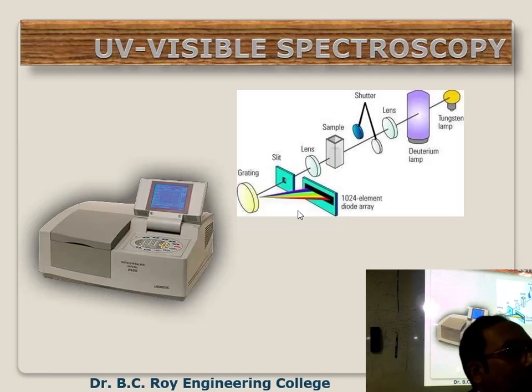One is ultraviolet. And what is spectroscopy? First of all, let me clarify. Take some matter you want to analyze. Pass some light through that. The light can pass through, it can reflect back, a part will be absorbed and part will be scattered. What are the options that I am telling? If you take some matter and put some certain light onto that, what will happen to the light? Either it will be reflected back, scattered, absorbed, or emitted. These are the options, right?